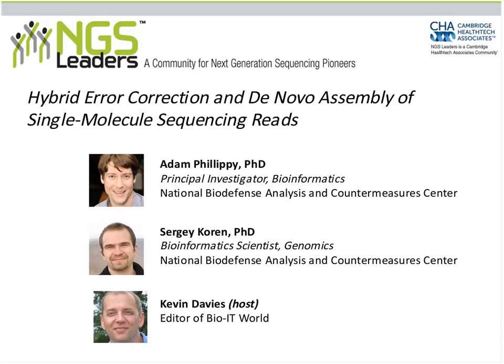Single molecule sequencing with long DNA read lengths, made most notably from the platform produced by Pacific Biosciences, has enormous potential for de novo genome assembly, but the rather high error rates associated with current technologies have presented some serious limitations in that regard.